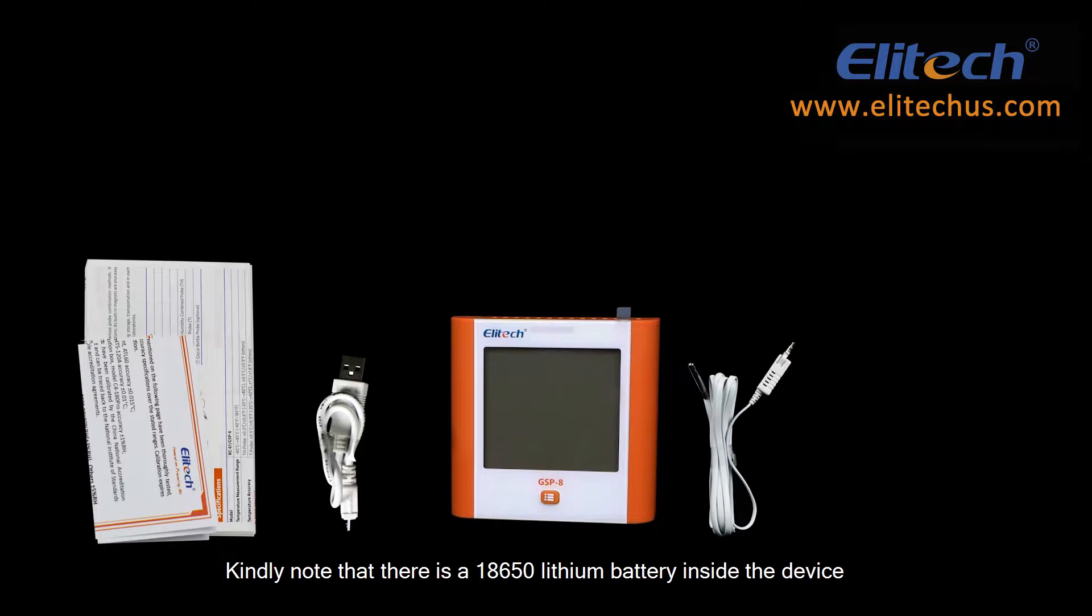Kindly note that there is an 18650 lithium battery inside the device.